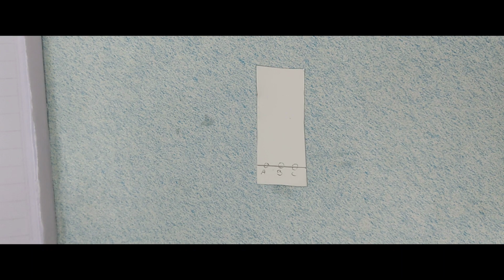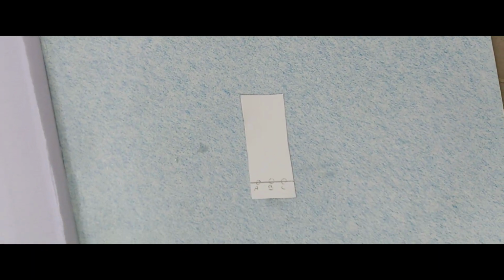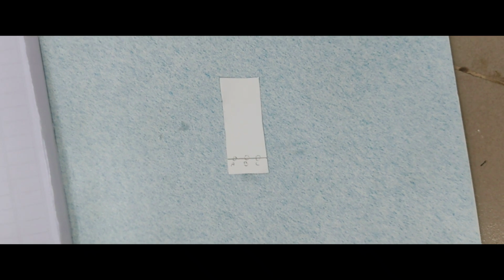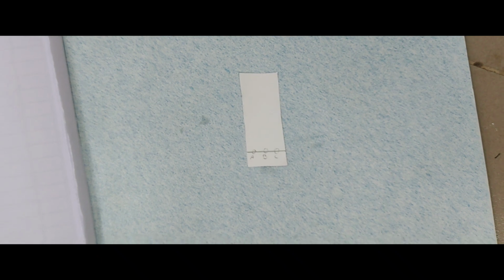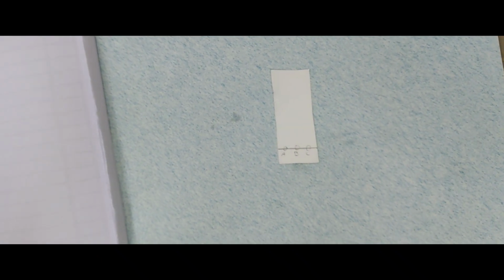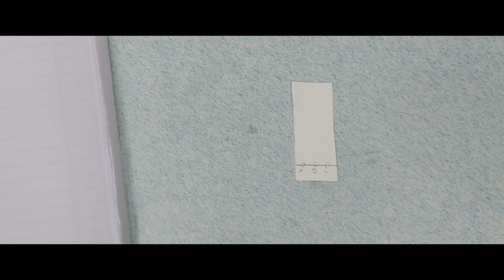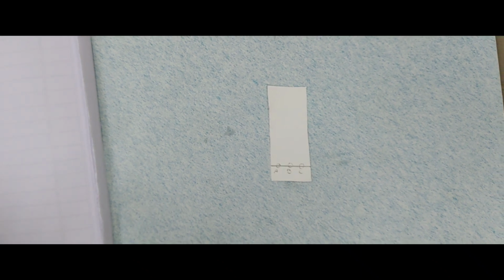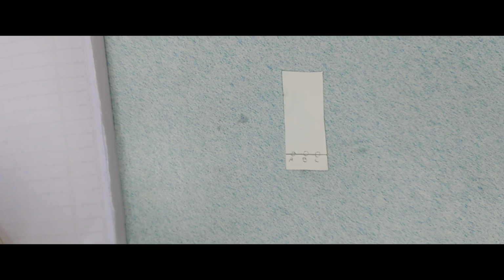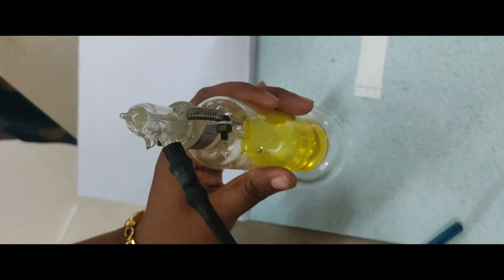The spraying reagent, or visualizing agent, is a 0.5% weight by volume solution of potassium dichromate in 20% H2SO4. We prepare it and pour it into a spray bottle, then spray it onto the surface of the TLC plate and air dry again.